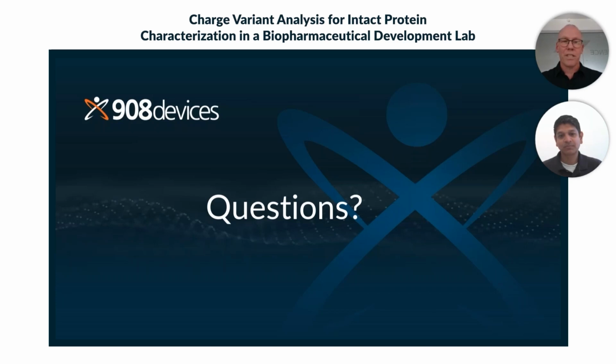If we see something changing in a reverse phase profile, that is the primary way we would go in terms of characterization. So it really depends, especially when you're dealing with products in clinical development, where you observe your modifications. Got it. Thank you.